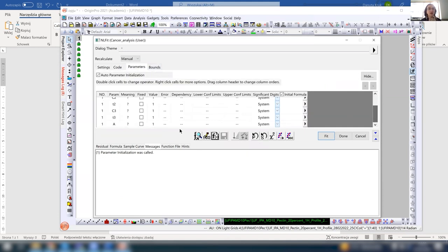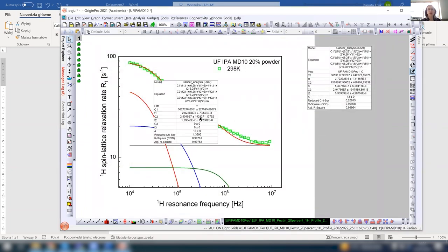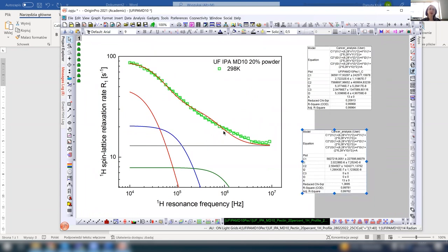So if I want to have only 2 contributions, I can make it like that. 5e6, 1e minus 6, 5e6, 1e minus 7. Yeah, so this is what you see here. With 2 parameters, this is the maximum you can get. One clearly sees that it does not really capture the essential features, yeah? This fit is not sufficient. So we need 3 contributions.